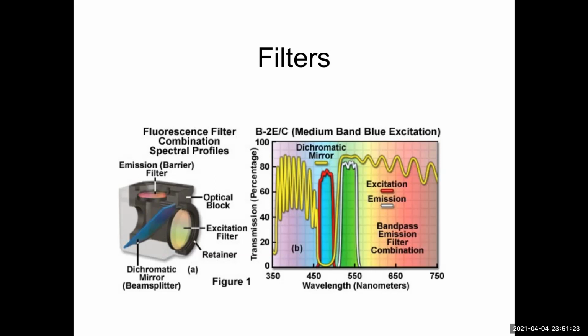So the color of excitation that you've got here is from 450 to maybe 500. They could put more detail in these graphs, but next week for lab, you're going to go into the websites of these companies and you'll see they give you the exact wavelengths when you look up a filter set. So let's say our excitation colors are 450 to 500. You want the mirror to go down to zero transmittance because it's reflecting those colors, sending them down to your specimen so that you get the fluorescence.